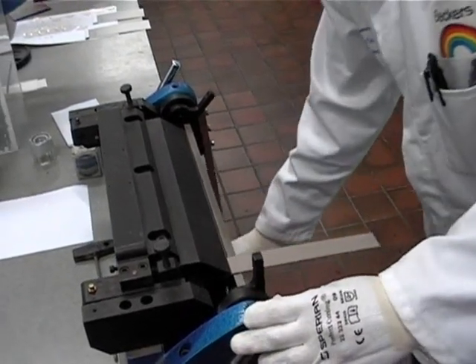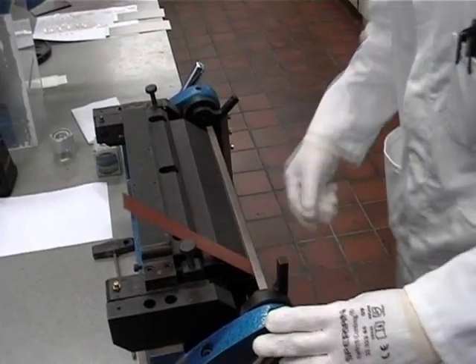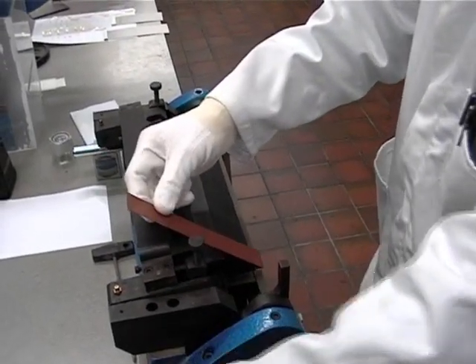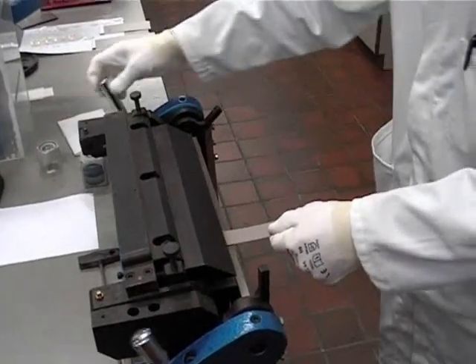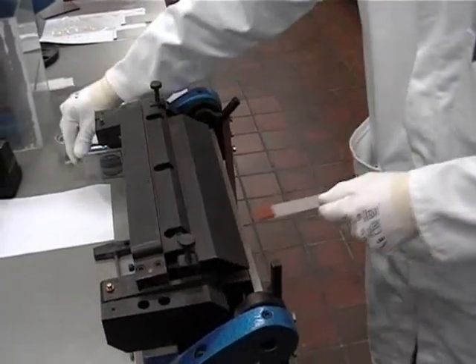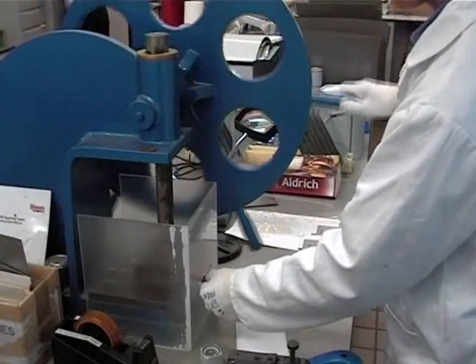EN13523 Part 7, often called the T-Bend test, is used to assess the flexibility of pre-painted metal and the resistance of the coating to cracking when formed. There are two methods described in the Euronorm, but here we only show the folding method, which is the most commonly used.